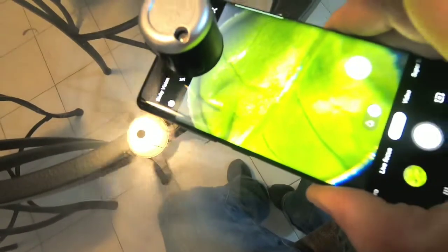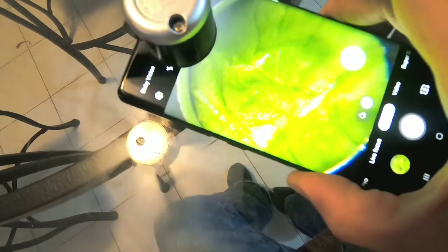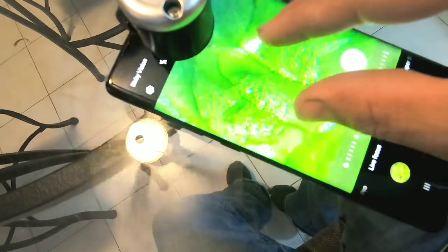You can see it connects pretty good and you can zoom closer. I found this pretty cool — I have a dead ant on my floor, and as you can see it zooms pretty good.